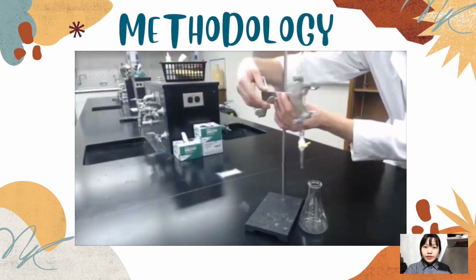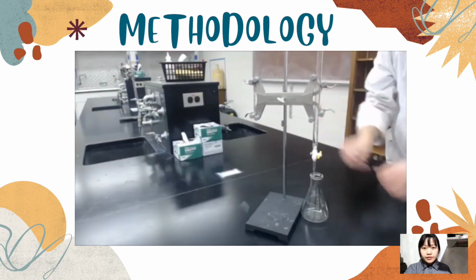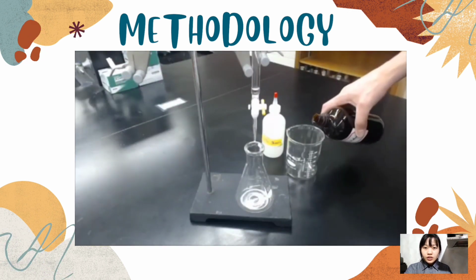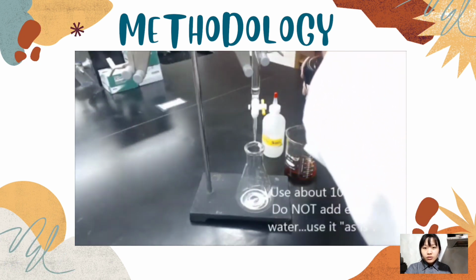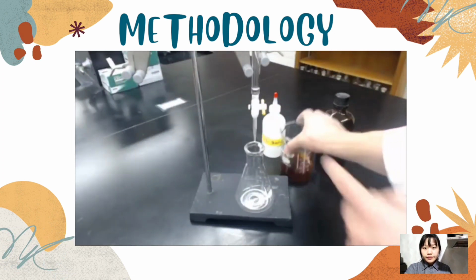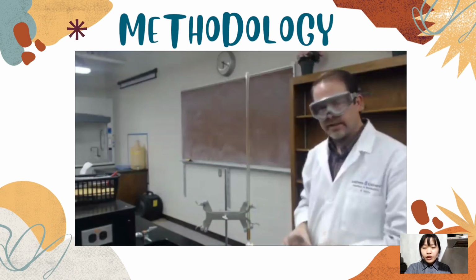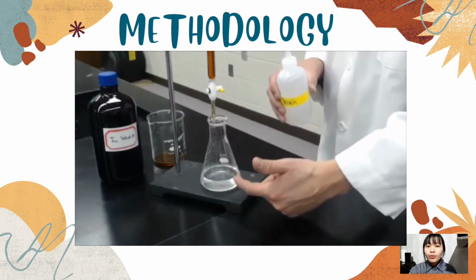The setup of the experiment. The burette and stand are prepared and adjusted properly. Then, pour between 50 and 100 ml of iodine solution, but 100 ml of iodine solution is preferred. You pour it into a 100 ml beaker and then you transfer it later to the burette. And step 3, remember to rinse a little bit of iodine solution into the burette before pouring everything into the burette.